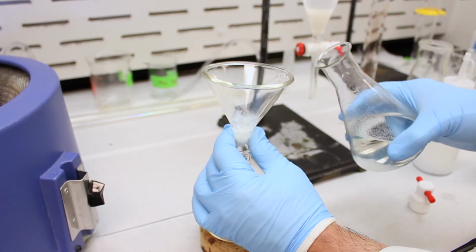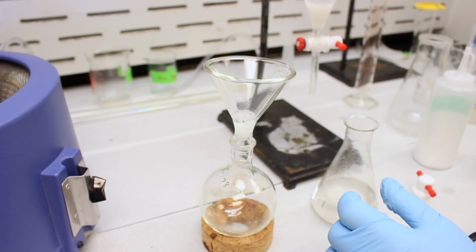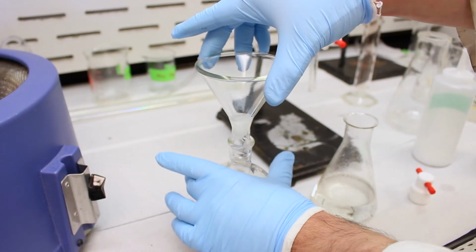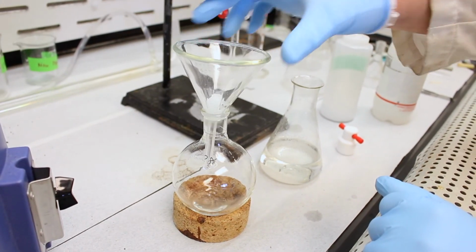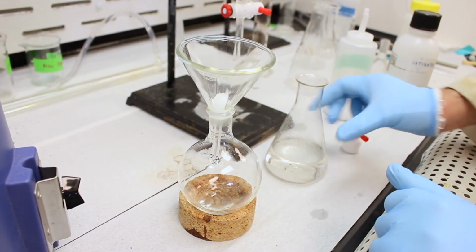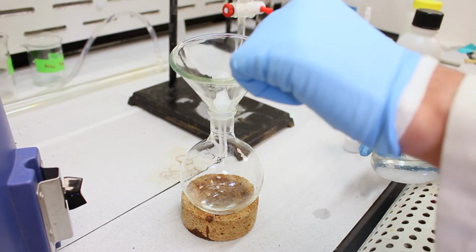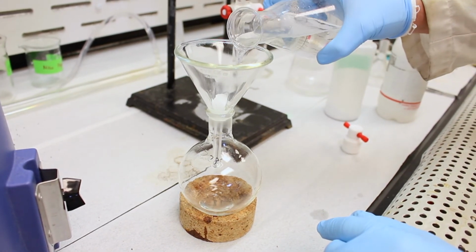Oops, see, it's being a little hesitant there. So pardon us while we get a separate funnel. This one seems a little too big. Alright, so we've got our new funnel here. This one should work a little bit better. And we've just replaced the cotton, so we've put the piece of cotton into this funnel, and we can continue with the filtration.